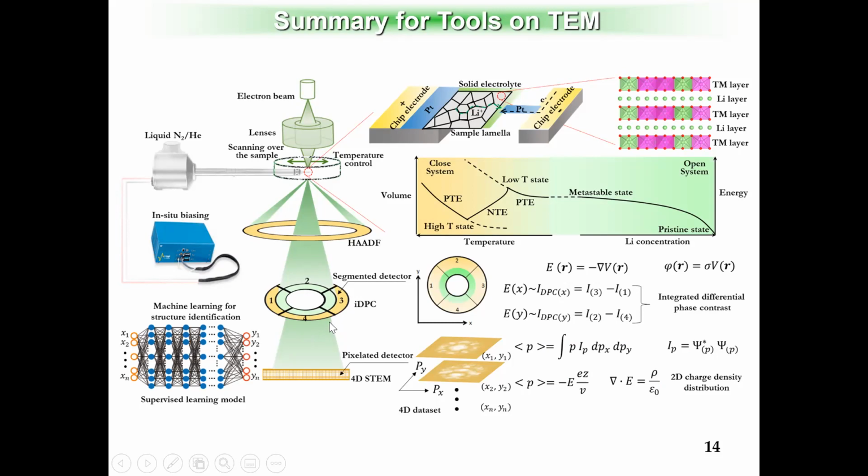I think from Thermo Fisher, the most developed segmented detector has 4 different sections, and in each section you have different phases for one location, and you can combine those different phases to get more information. And in this kind of imaging, you can image all the elements, including the heavy elements and the light elements, right? And we also, so this is the liquid, the cryo TEM part.